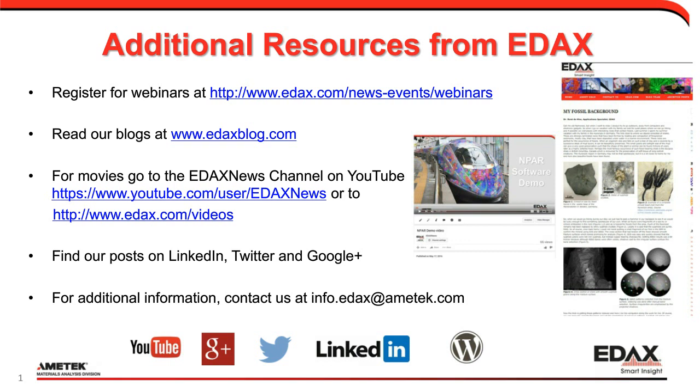Another question we had was which version of OIM allows dynamical pattern simulation? It is still being worked on. We hope to maybe release it by the end of the year, although I must admit I can't make any promises at this point. There's still a few things we're working through. But as you saw, there are some of the screenshots. We are making good progress and are getting close. And basically, we're having fun playing with it before we send it out for everybody to use, make sure we understand when it will work and when it doesn't and how we can help folks with that.